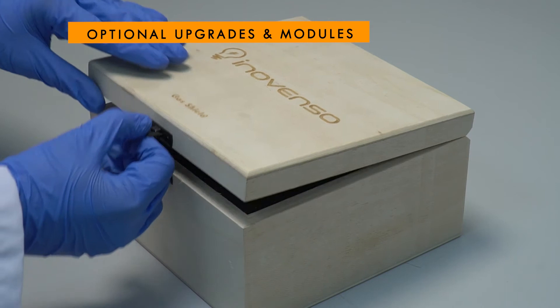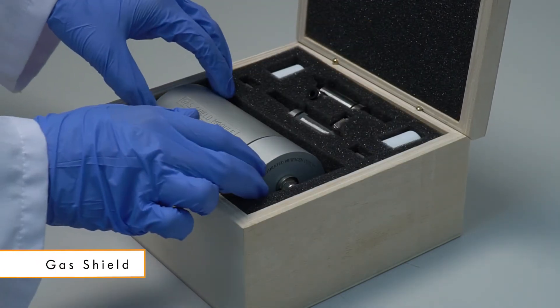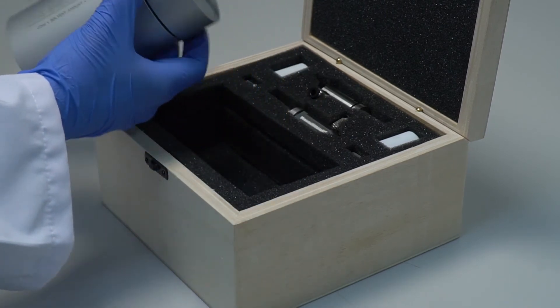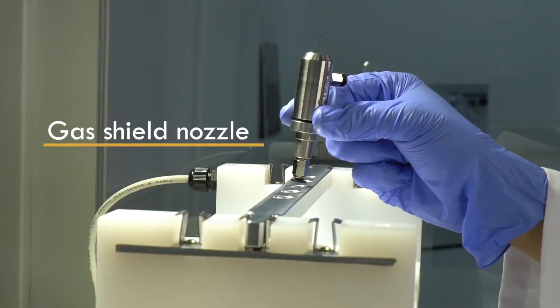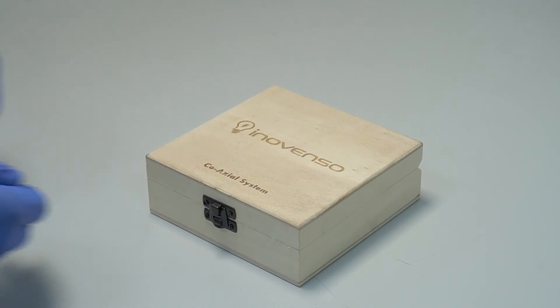In addition to this, the machine has optional modules such as the gas shield, where you can connect your gas pump or your laboratory gas tank to allow the jets to be infused with additional pressurized air.